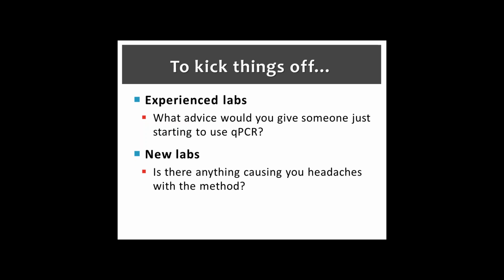For those who didn't hear, and for our online audience, the response was that they ended up putting a piece of colored paper behind the pipette so they could see the fluid a bit better. Does that have a chance of introducing contamination, like DNA? Would you UV the paper? Yes, you can just UV the paper. The question is whether you would potentially introduce some contamination with that piece of paper, and the response was, you can UV the paper.